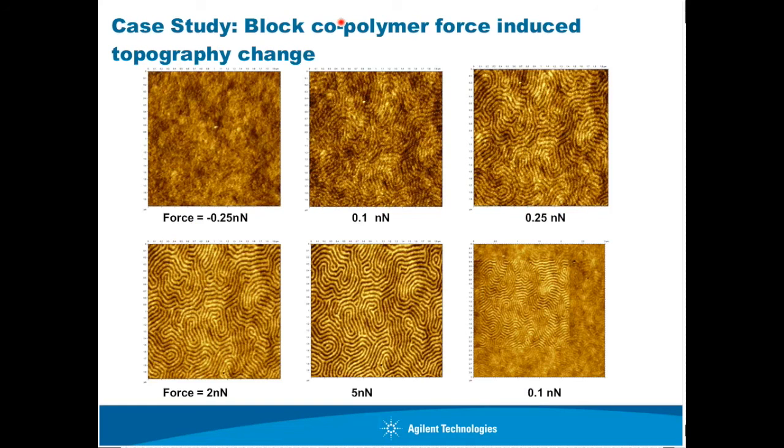This is also covered in one of the early presentations, The Physics of AFM, part number 3, I believe, probably part number 2. We can also chat about that. You can actually measure or calculate the repulsive force between tip and sample, and you can manipulate it by controlling the drive and set point. How to do that is covered by that presentation. And 5 nanonewtons is actually a very high force, and the way to do that is to increase your drive. How high it is, it's relative.